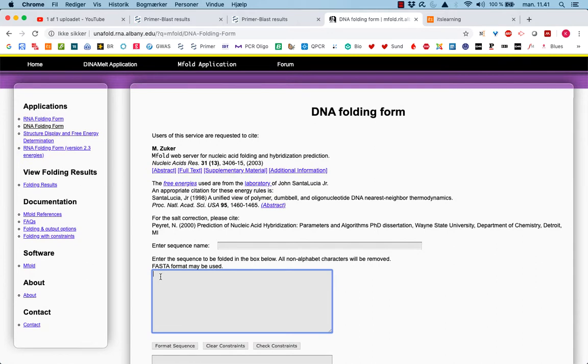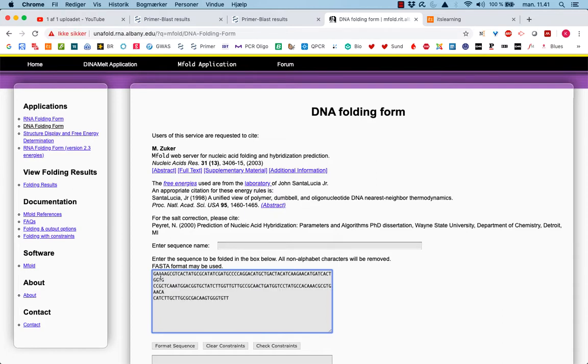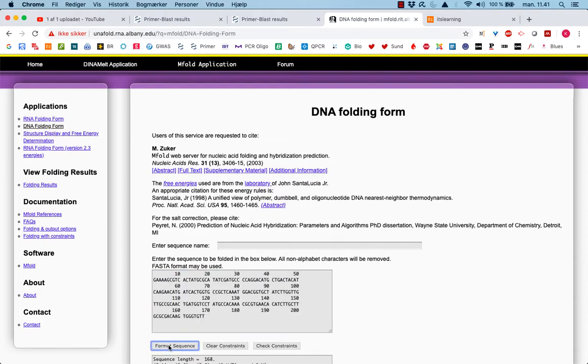What you could have done here, you could have taken the whole sequence we found, more than 1000 base pairs, but that's not really relevant. We want to see just the size of the product, how that would be. So I paste the sequencing from Word.